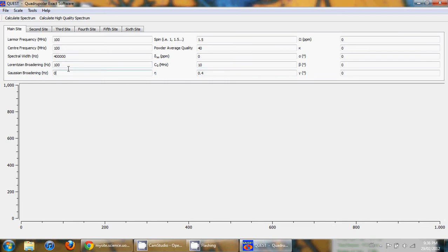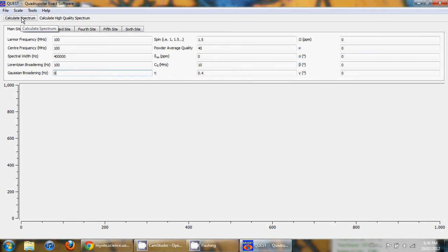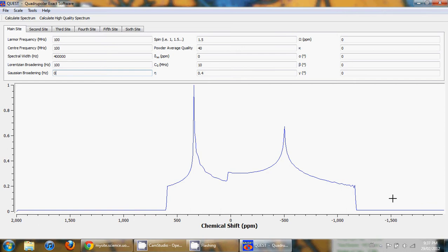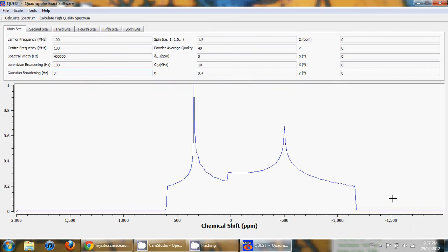Lastly, you can also add Lorentzian or Gaussian broadening to the spectra. To calculate a spectrum you can simply click on the calculate spectrum option at the top left, and once that's done the calculation progresses and you get the simulated NMR spectrum. It's also possible to simply hit the return key which also calculates the spectrum.